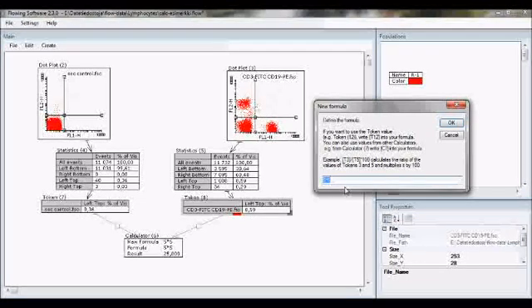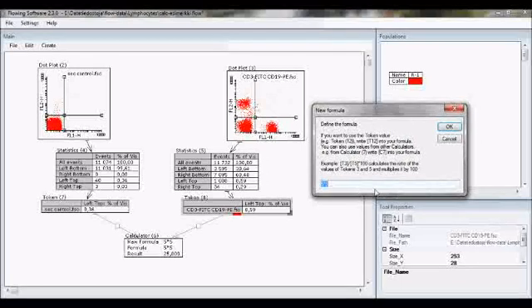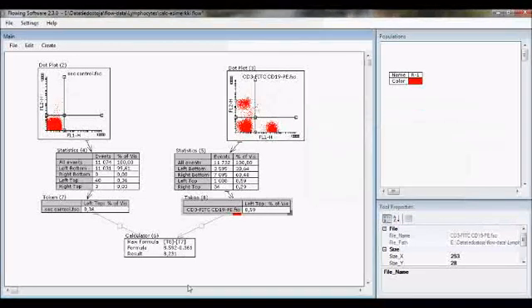So in the instructions it tells us how to refer to a token. Token 8 minus token 7. This is token 8, this is token 7. Token 8 minus token 7. Okay, and now we have the result.